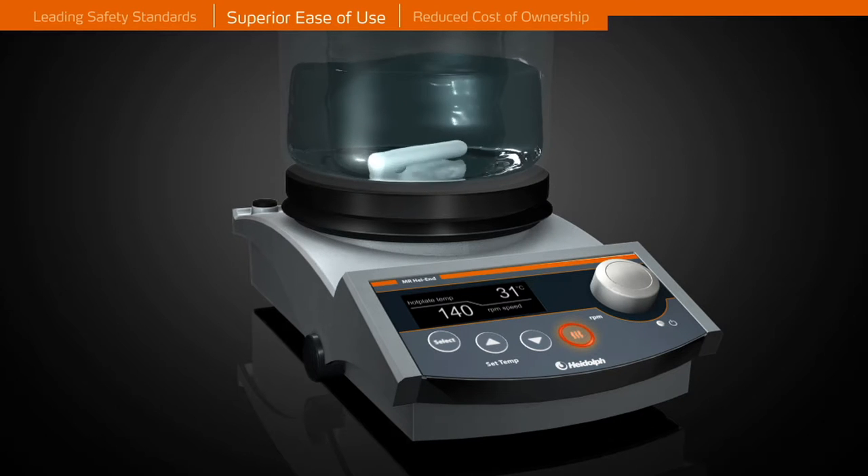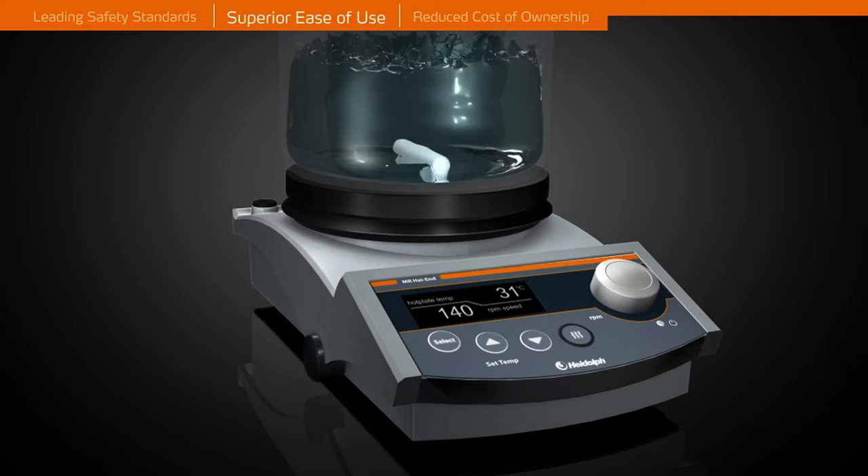In the case of the heating function failing, stirring will not be interrupted. This will prevent bumping.